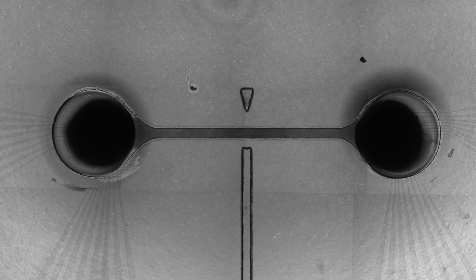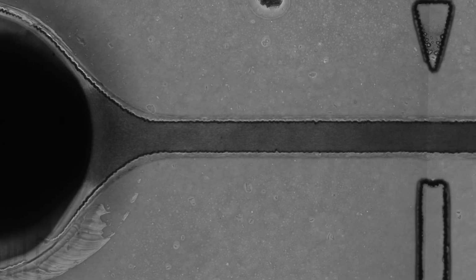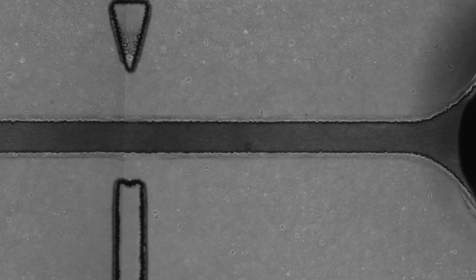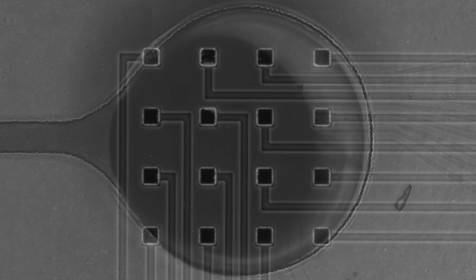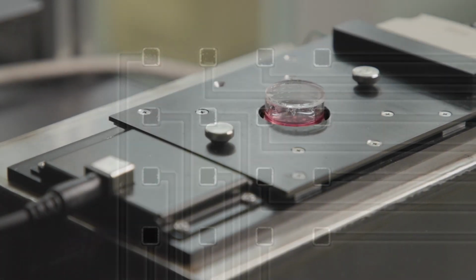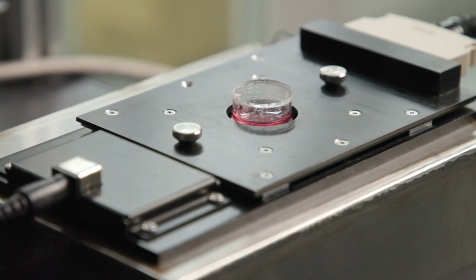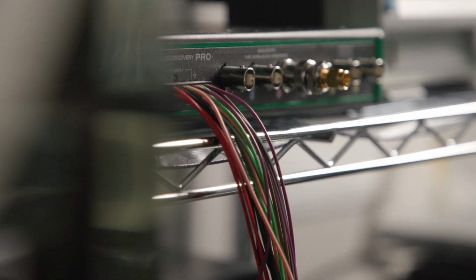These two clusters of neurons are connected by cords of cells called axons. Each cluster is connected to a microelectrode array that stimulates the neurons according to a remote input, in this case, a person's voice. The electrodes then record the activity patterns of the neuron clusters in response to the stimulation. The signals captured from the neuron clusters are then converted in real time into sound and visual data.